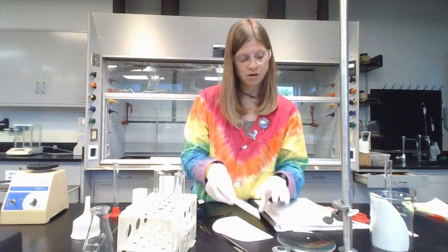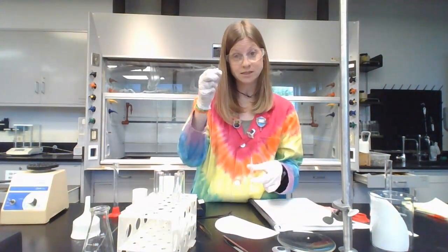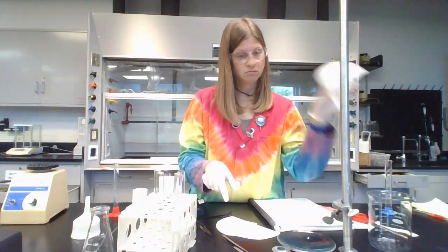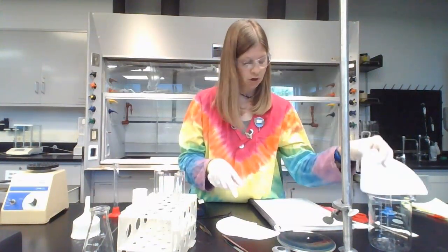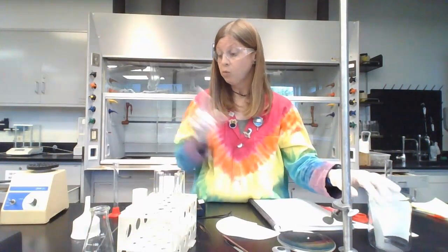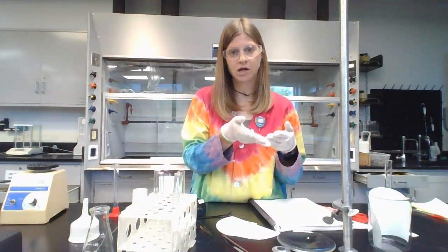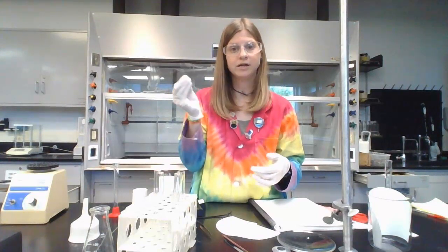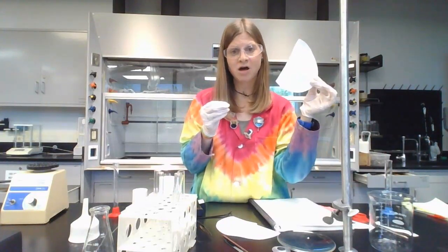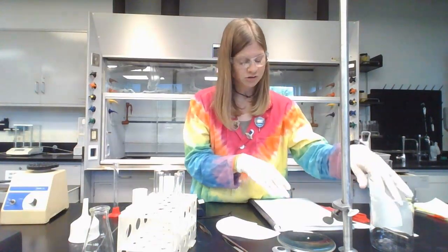At the end of the lab, in the broken glass box, you need to put your TLC plate and your micro pipettes. The filter paper just goes in the trash can. The rest of the glassware just needs to be washed and put back. Oh, I lied. The other thing is the filter paper with the aspirin on it, that will go in the same container as the solid aspirin because there's going to be solid all over it. Okay, so this piece of filter paper didn't have anything on it other than the liquid that was in there, and it's going to probably be dried by then. So that goes in the trash can.